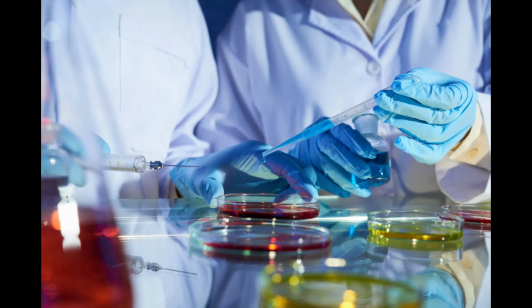If you flip to page 47, there are several pictures here of how to do a streak plate dilution. At the top, 1.35A, B, C, and D show pictures of how to, and I'm gonna show you how to do it, but there are pictures there of how to do it. 1.36 on page 47, see that picture? Shows you how hard to press on your agar, right? Too vertical, just right, too flat. So it gives you helpful tips there. And then there's a practice on page 51 that we'll do later.